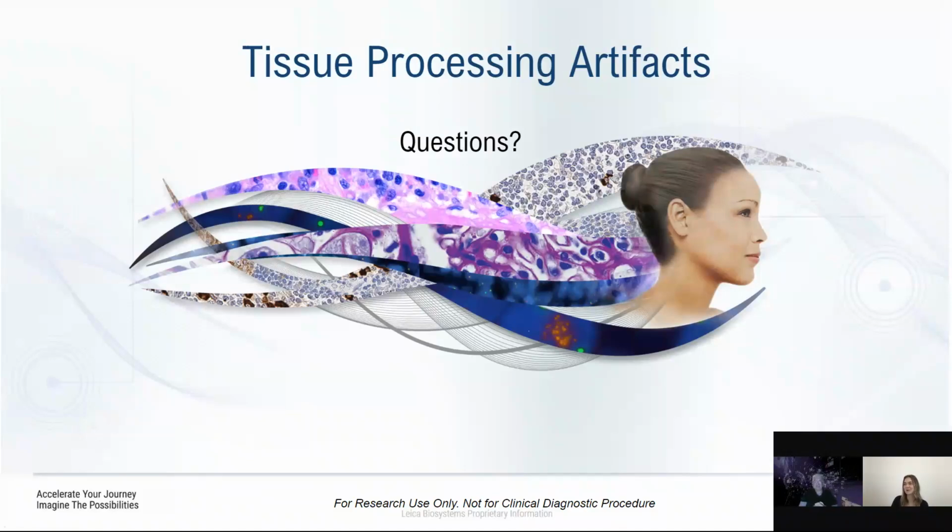This next one is a two-part question. If you have a large specimen sample, would you recommend to cut the specimen to increase fixation efficiency, or would extended time with a processor suffice? And the second part asks, would the former method limit underfixation from occurring or autolysis? So yes, there's probably yes, no. Let me break it down.